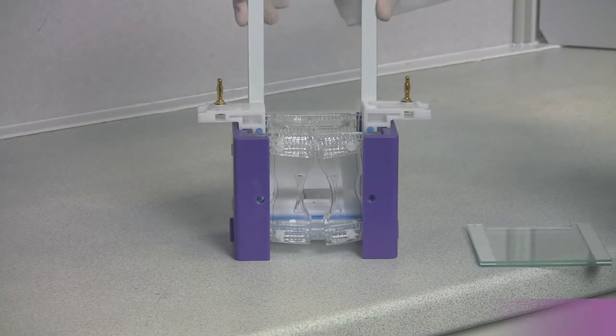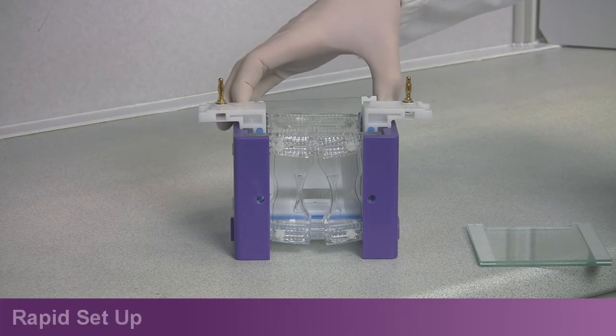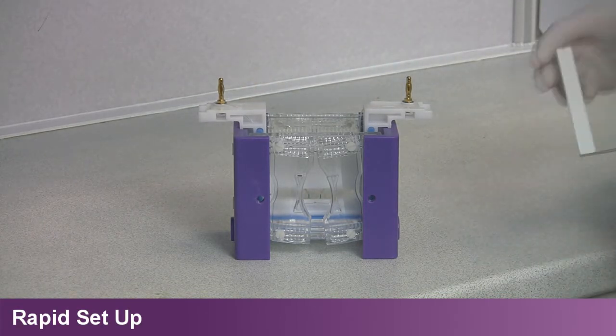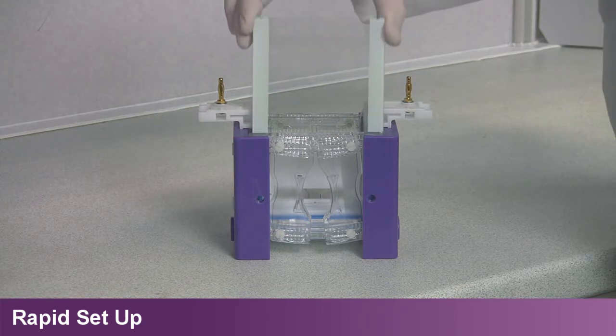Unlike other manufacturer systems, the Page Insert may be used for both gel casting and gel running. This eliminates time-consuming transfer of fragile gels between separate casting and running modules.